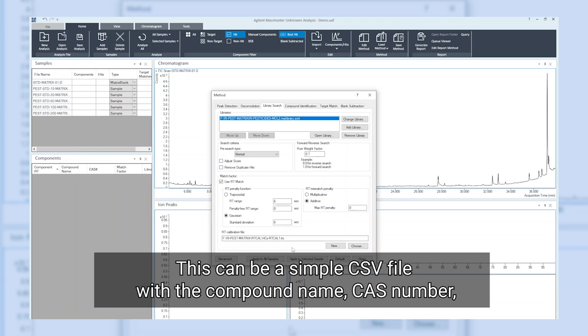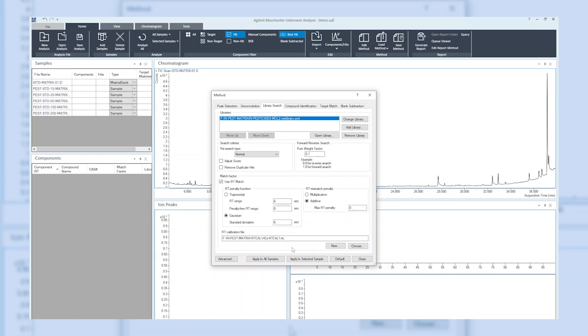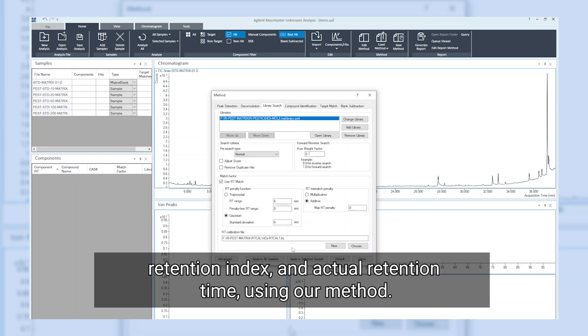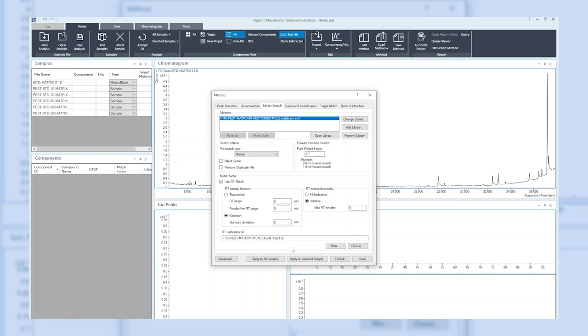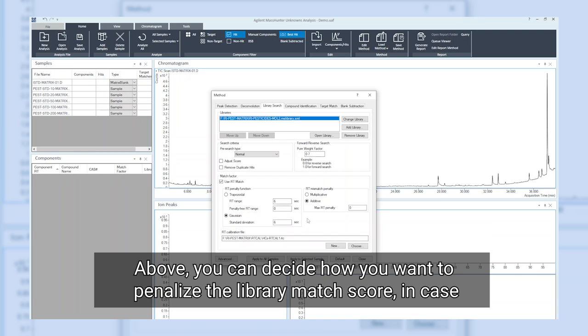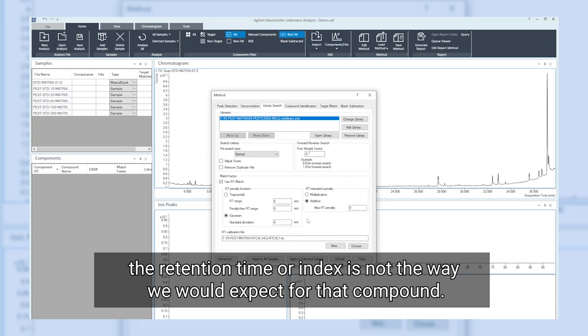This can be a simple CSV file with a compound name, CAS number, retention index, and actual retention time. Using our method above, you can decide how you want to penalize the library match score in case the retention time or index is not the way we would expect for that compound.